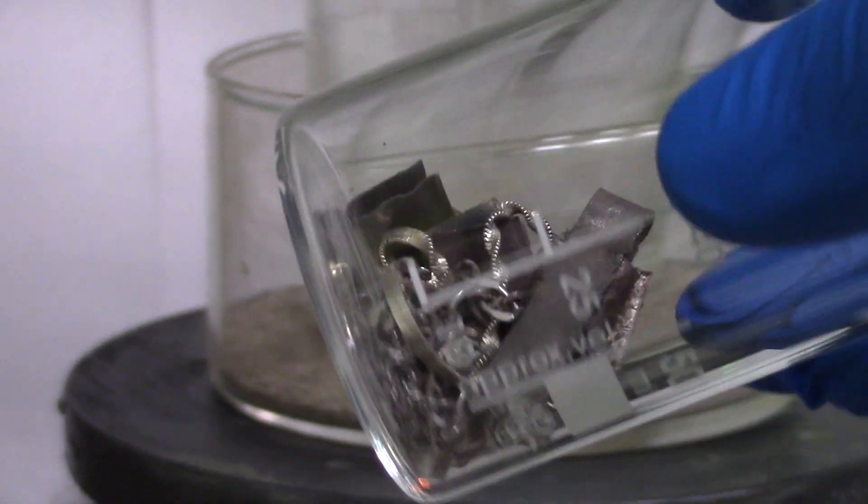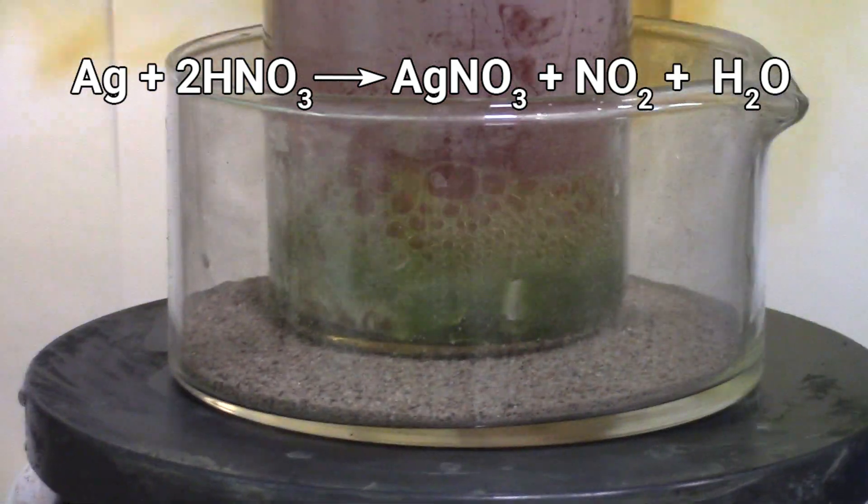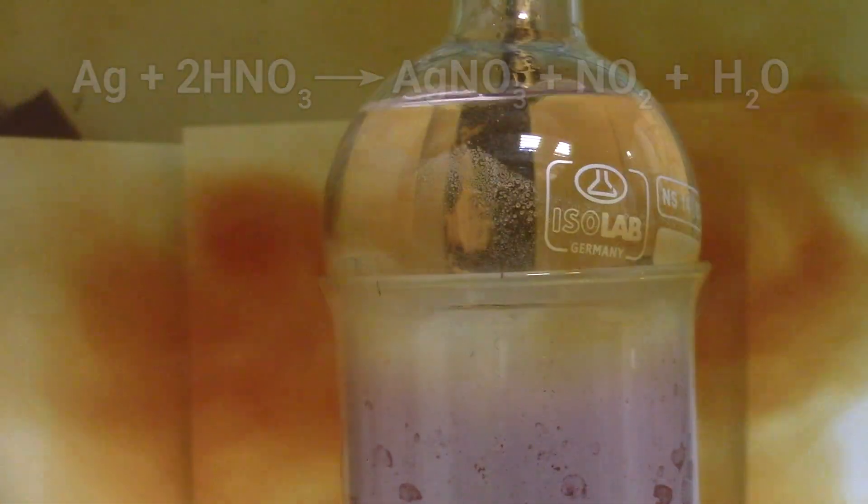So now I add 16g of used silver electrodes, jewelry and powders mixture. As you can see, while nitrogen dioxide starts to evolve, I recommend isolating it with a water-filled flask even when working at the fume hood.